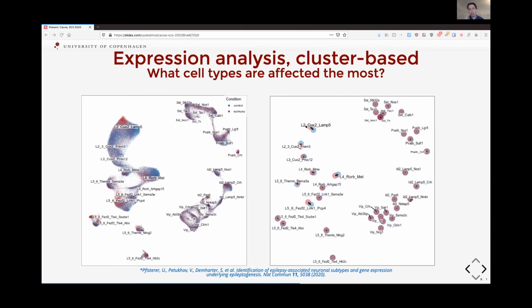And then you can estimate distance between these 2 centroids and say that it's kind of a measure. This measure would not exactly work because it's affected by lots of covariates, particularly by spread of a cell type. So you see that if one subtype is super spread, then the distance is of course higher between the centroids, and if they're very narrow, the distance is low. And the same with number of cells, just statistically, the fewer cells we have, the higher distance we would expect.